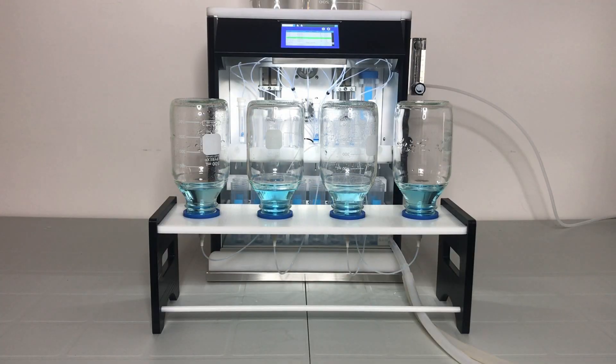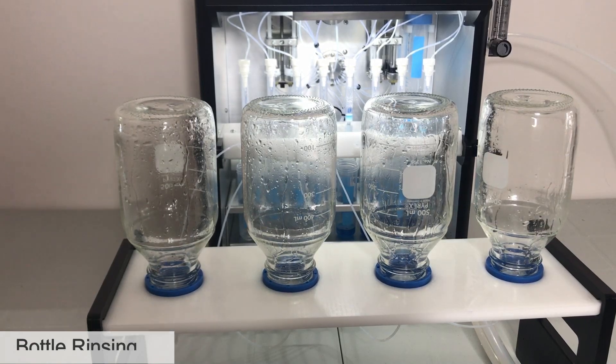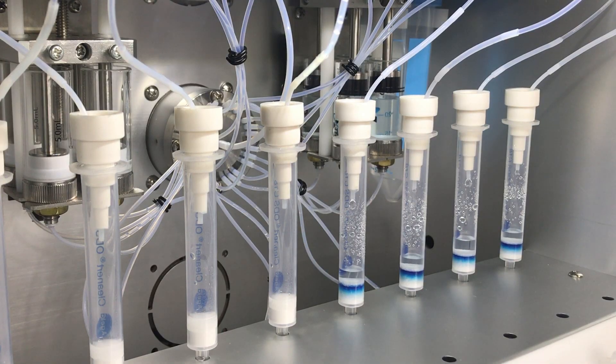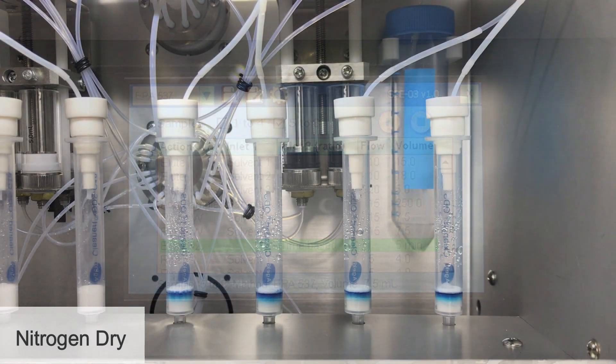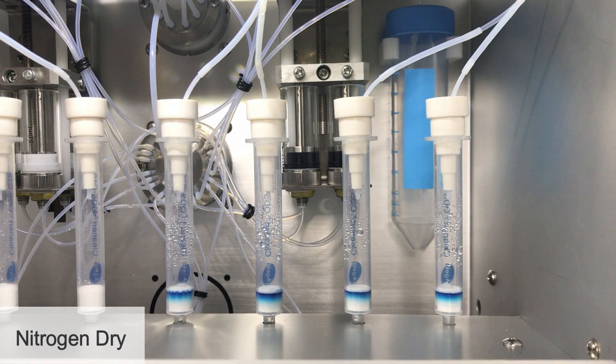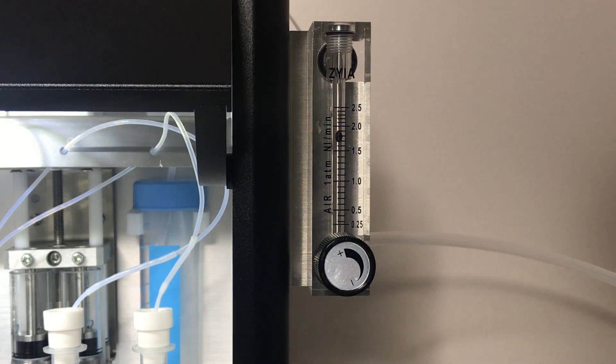Once the 250 millilitre samples are loaded, the system automatically rinses the sample bottles with reagent water and delivers the rinsate into the SPE columns. This is followed by 5 minutes of nitrogen drying. We recommend using a pressurised source of 15 to 20 psi, and setting the flow meter to around 2 litres a minute.